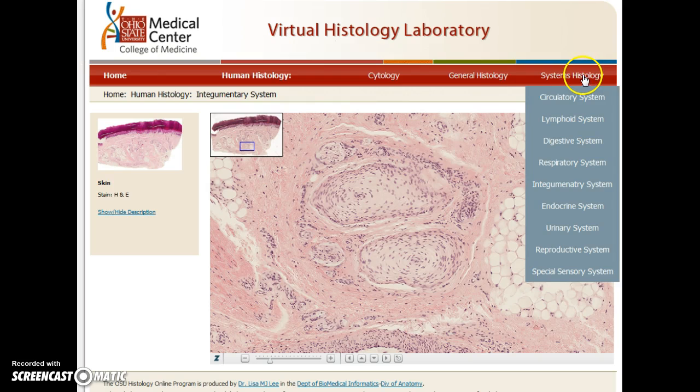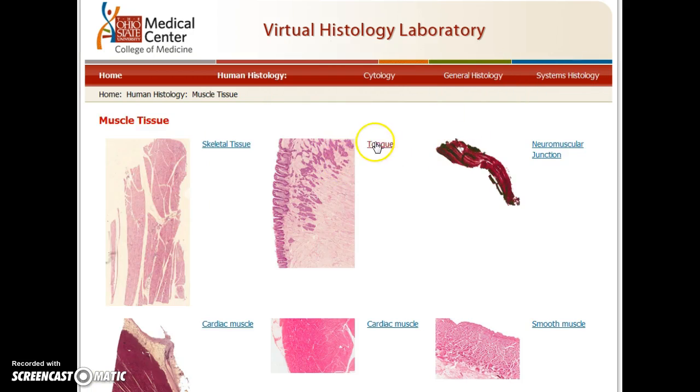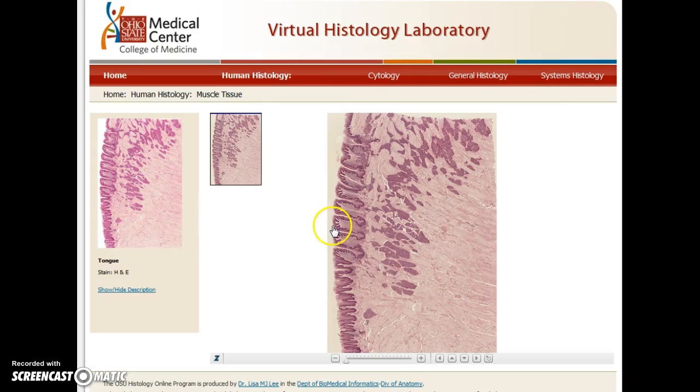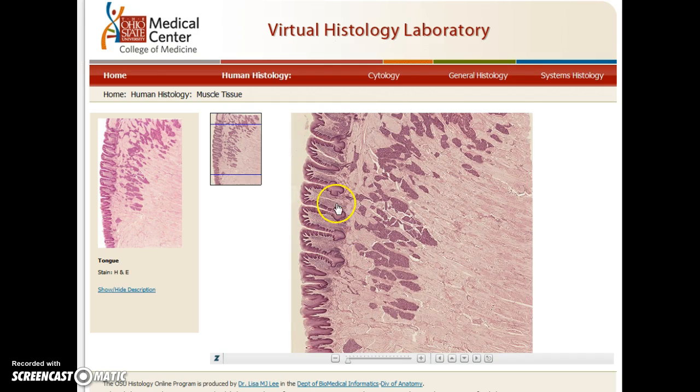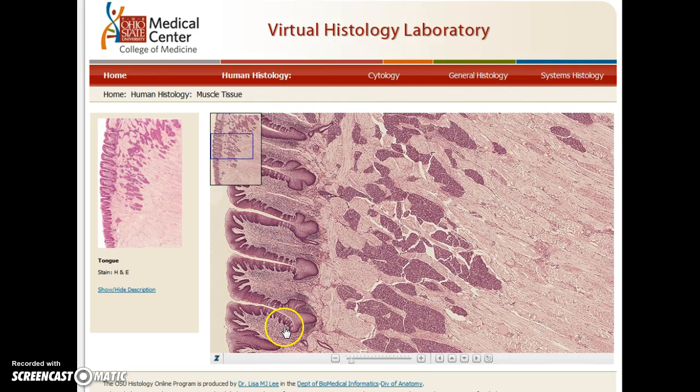And then for the taste buds, strange place to look for it here, but here's the tongue. And so this is the outer surface of the tongue. This is what your food sits on. And so each of these little peg-like structures here is a papilla. So we have several papillae, if we're talking about plural.